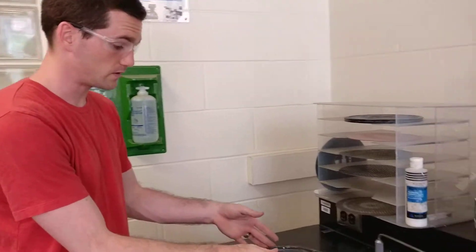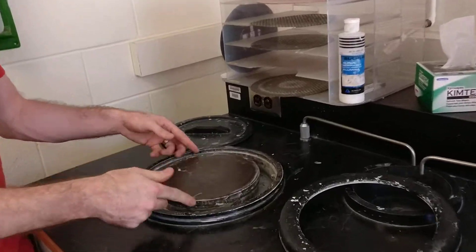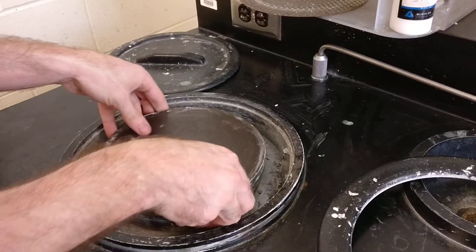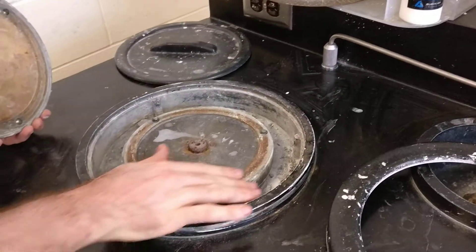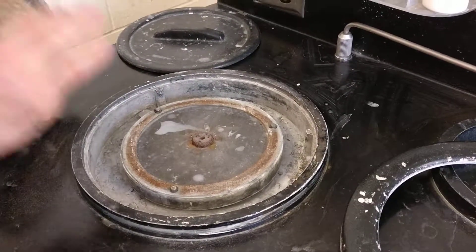These are the grinding and polishing wheels. There's a lid and a plastic ring. If you come in, you can see that this is a magnetic disc. If you lift this off, there's a cork ring, and there are three black O-rings on here that keep it all level.